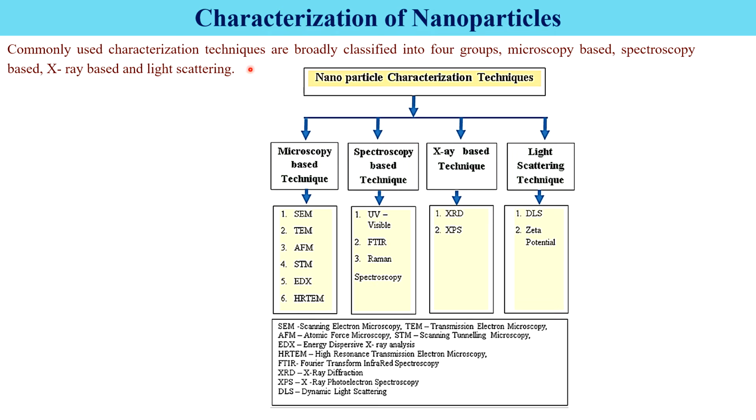Characterization of nanoparticles. Some commonly used characterization techniques are listed in this video. Commonly used characterization techniques are broadly classified into four groups: microscopy based technique, spectroscopy based technique, X-ray based technique, and light scattering technique.